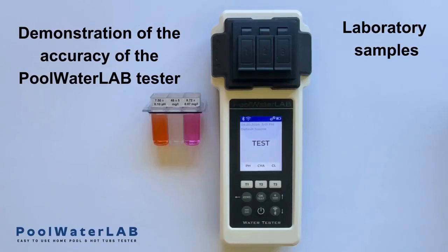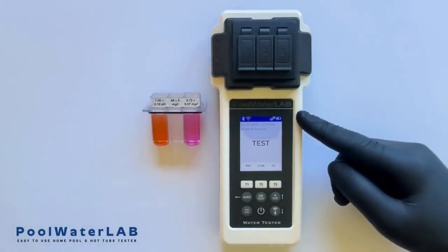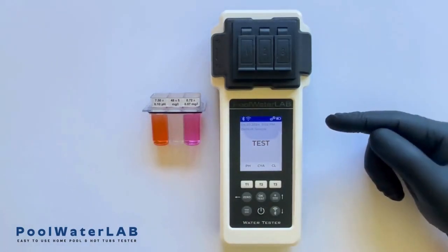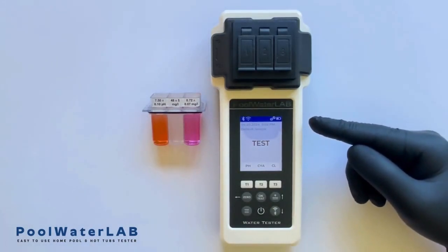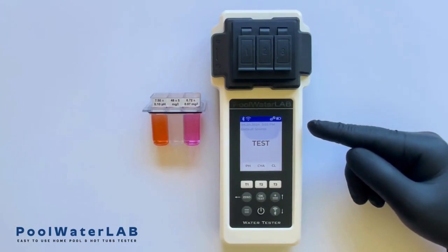Welcome to our demonstration video where we showcase the exceptional precision of the pool water lab tester. Designed for pools, hot tubs and jacuzzis, this device proudly meets the L1 accuracy level as defined by American standards, representing the highest level of precision currently achievable in the industry.